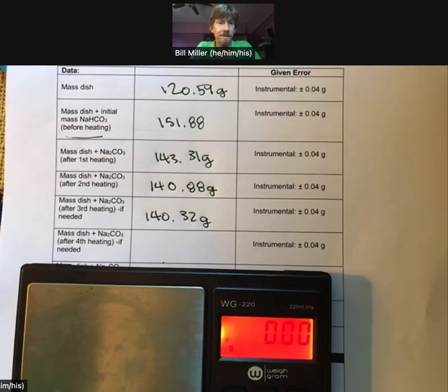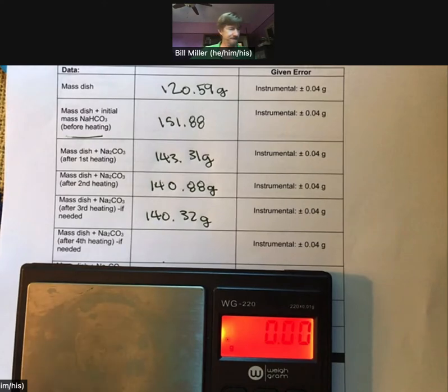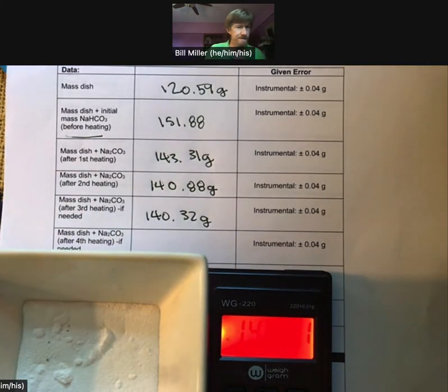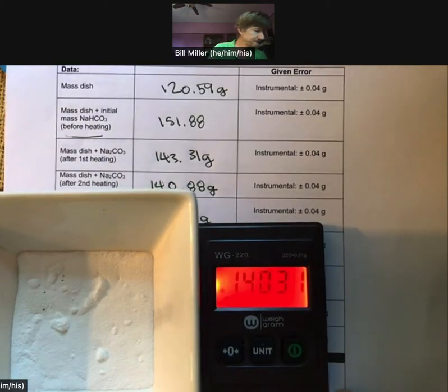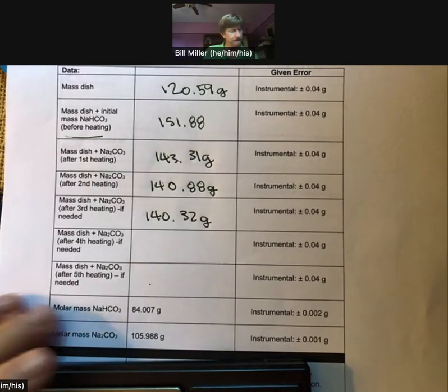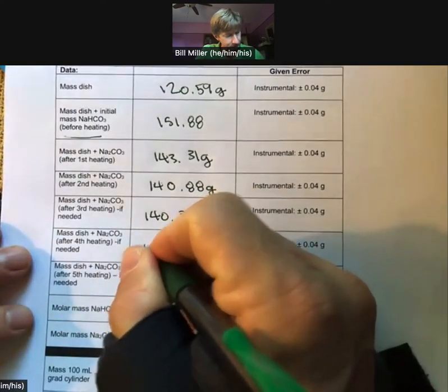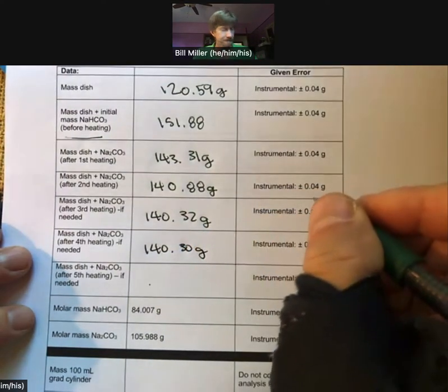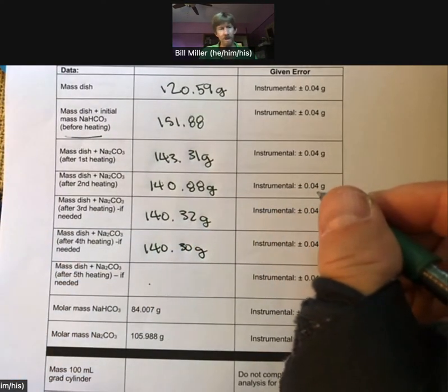Another 30 minutes of heating at 400 degrees Fahrenheit and 20 minutes of cooling. Let's see what we get this time. Oh, we went back to 30. It was going between 30 and 31. I'm gonna put the smaller number because it seemed to end there, although you could have put either one.